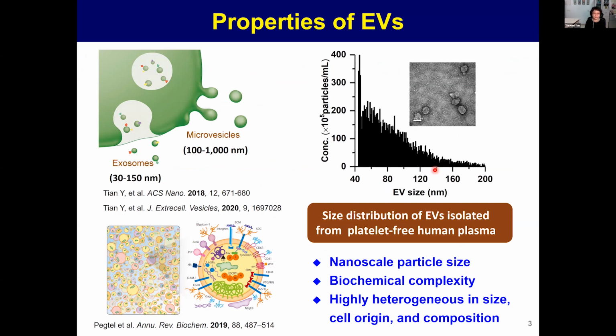So we all know the EVs are nanoscale membrane-bound vesicles.